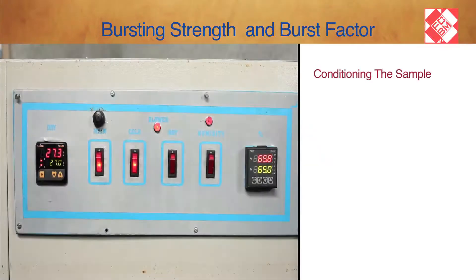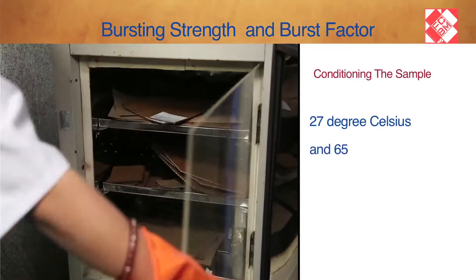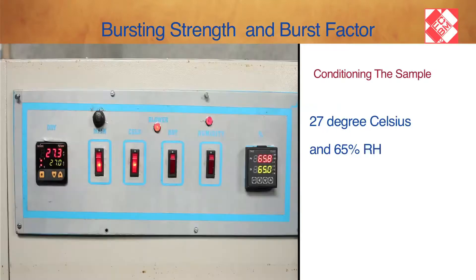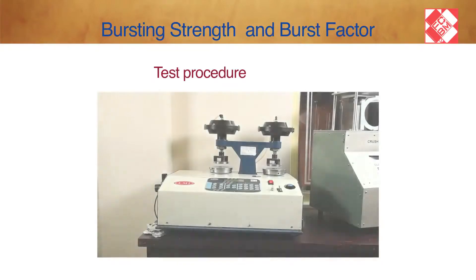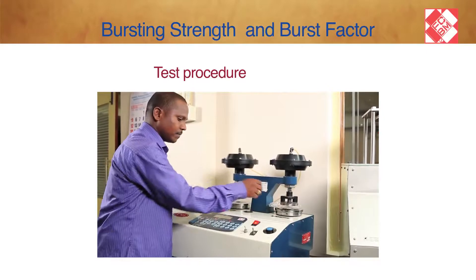Condition the sample at 27 degrees Celsius and 65% relative humidity. For the test procedure, place the sample to be tested over the diaphragm plate.